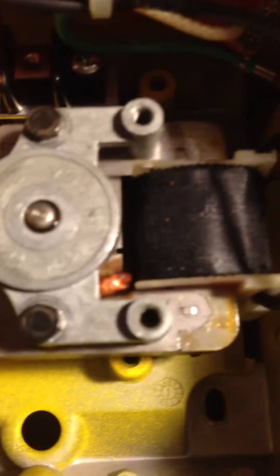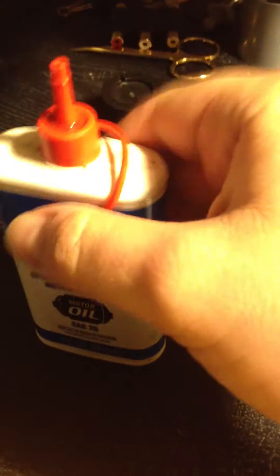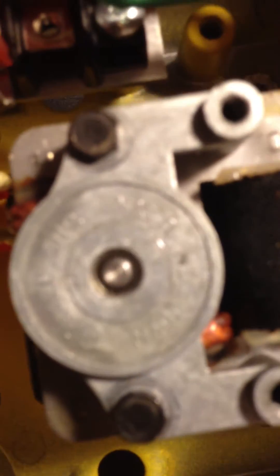Then when you get done with that, it dries out, and you'll take your 3-in-1 oil and you'll just put a little drop in here. Then you want to let it run for a little bit more and twist it around. After a few good twists and push it in and out, let the oil get in there and get it all cleaned out. It should be back to normal.